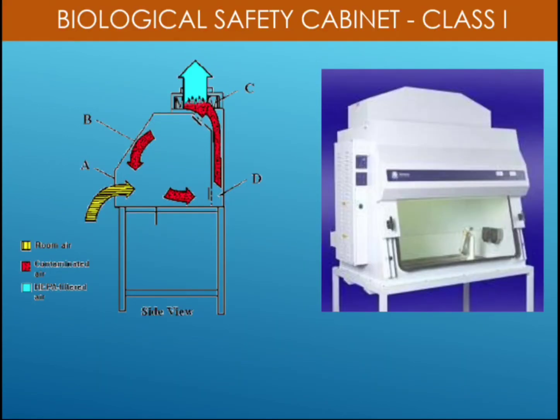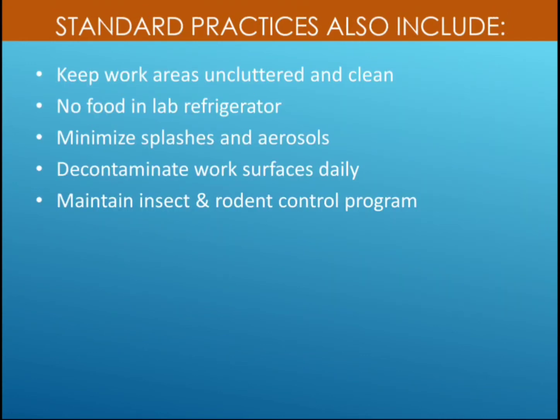Then in biosafety level 1, class 1, HEPA filters should be used. Okay, room air should have positive pressure whenever you are working at a workbench, whenever you are transferring pathogens from one plate to another or one flask to another flask. Then standard practices include keeping work areas uncluttered and clean. Uncluttered means it should not be dirty or messed up with plugs, ropes and paper. It should be very clean.